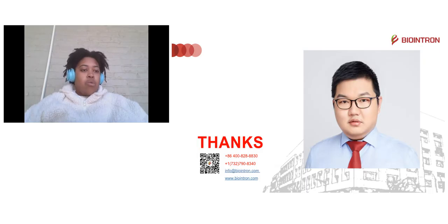So while we're waiting, because it looks like some people are filling out the poll, please add more questions to the Q&A. The first question for Dr. Wu is, how do you detect hydrophobicity? Yeah, we use the HPLC method. So we have a column with a short or long carbon chain, and we run the experiment in the HPLC machine. So it's like SEC but with different columns.